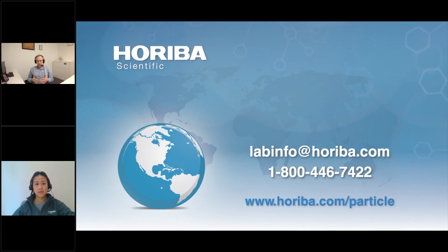When we check an instrument out, we will calibrate, in the sense of confirming instrument performance, with a particle standard. If you get the right answer, you know everything is fine. If you don't have a sample prep problem and you get the wrong answer, you're really going to have to go back and repair something in the instrument.